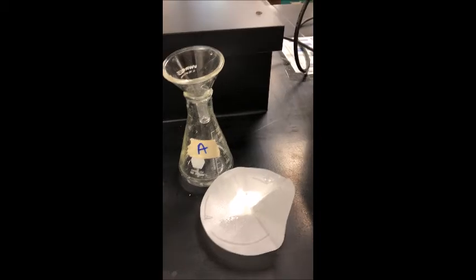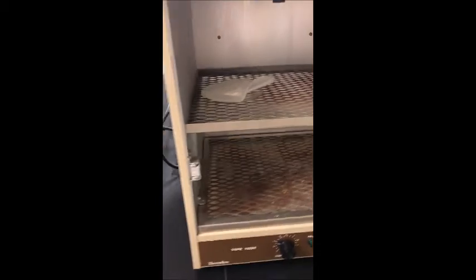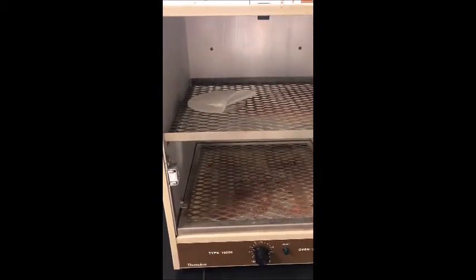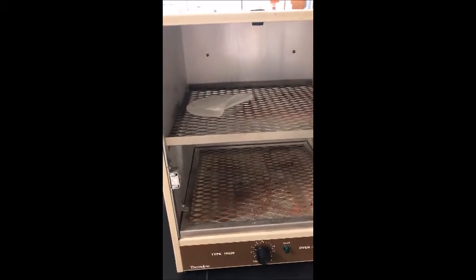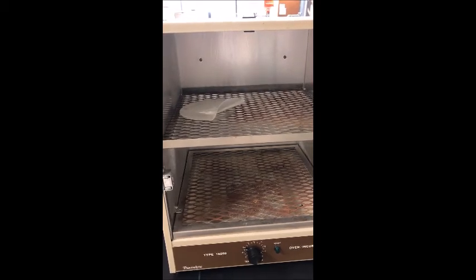Now, what we're going to do here is I'm going to stick it in the drying oven for about 20 minutes, and then I'm going to poke through it and make sure that it's not clumping, and it's going to dry thoroughly out so that there isn't moisture still left in the middle clumps. I'm going to do the same procedure for B and C as well, and then tomorrow I'll come back and measure the mass of the precipitate on the filter paper.